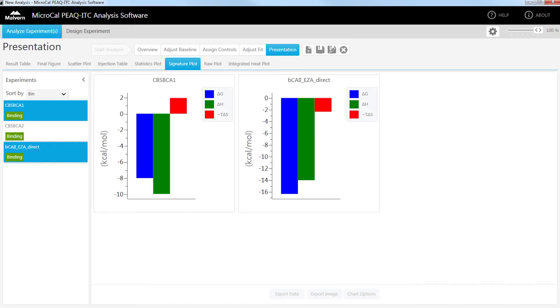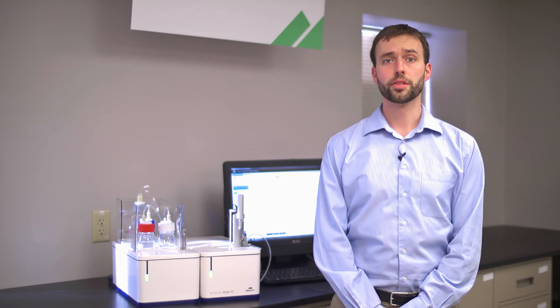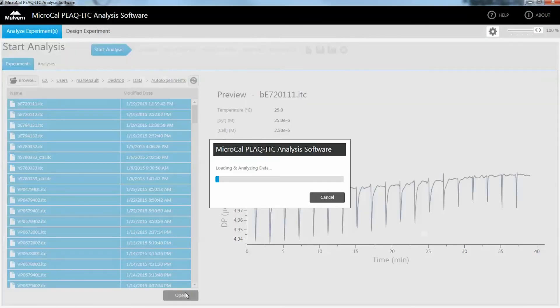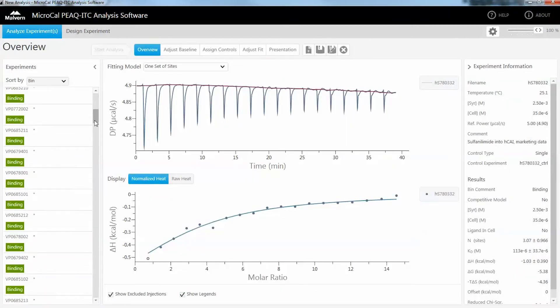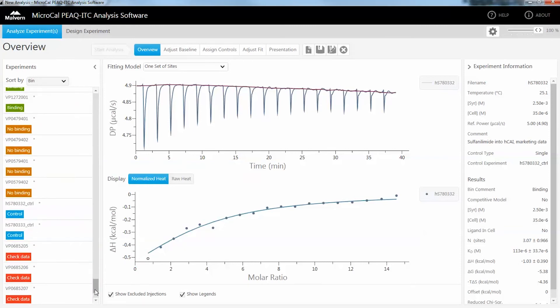Our users also need to accurately and reliably rank and characterize large numbers of low molecular weight ligands based on affinity and energetics of interaction. Notice how ITC can discriminate between the enthalpic and entropic contributions to binding affinity, especially for those who wish to study and present structure function studies. There are a number of new features that make the MicroCal PEAQ ITC particularly well-suited to hit validation and lead optimization laboratories. Here we are loading 150 datasets. Within seconds, they are characterized according to data quality and extent of binding. This will be invaluable to users when organizing their results or when performing non-subjective data analysis.